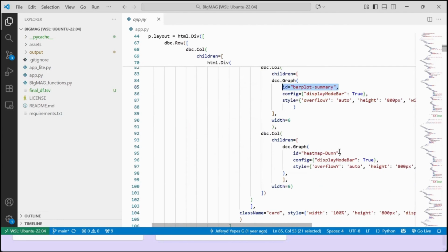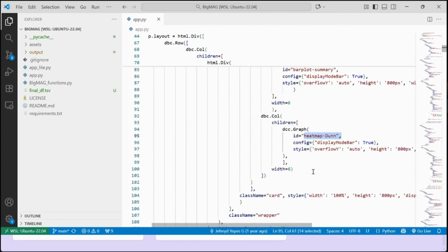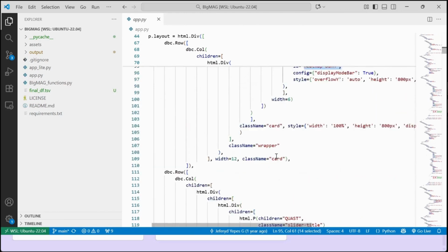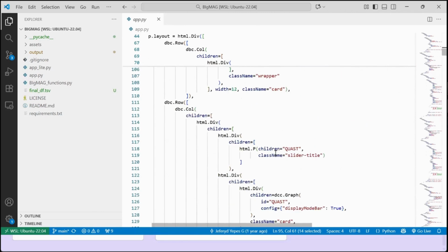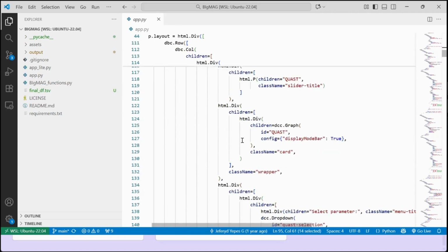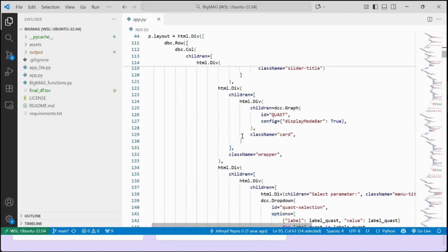So for each of them there will be an ID, or you can combine them. You see that it becomes a bit repetitive, because then, okay, here comes another row, and what is in these other rows, or title and everything organized in the display that I showed you before.